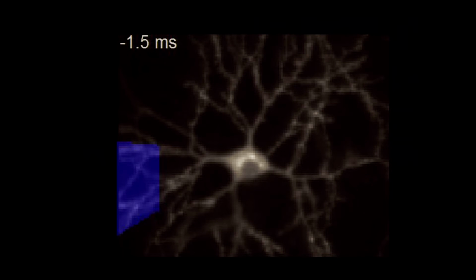Here's another example. Here we're stimulating not the soma, but we've just drawn a patch over here, and we're going to stimulate some dendrites. This is, again, I think at 50,000 frames a second. And you can see the action potential propagate through the cell. And again, if you look closely, you can see that the action potential is starting over here, not where we stimulate. And so what's going on?